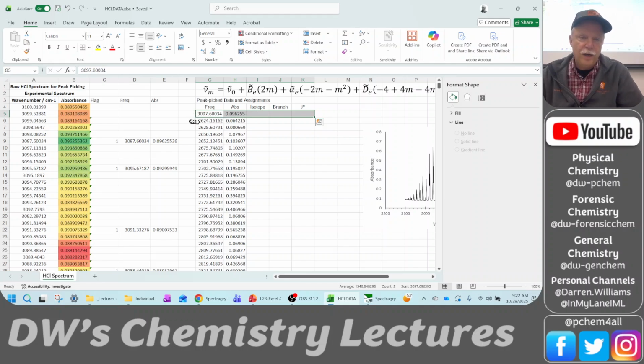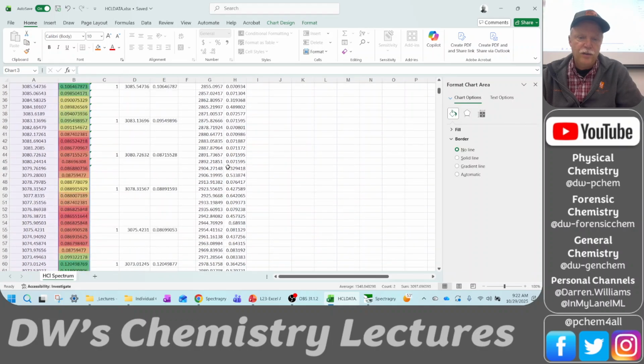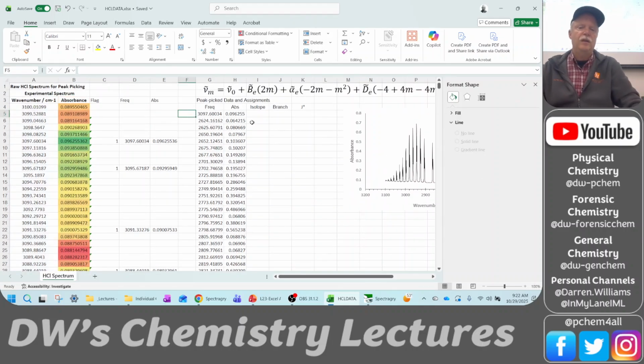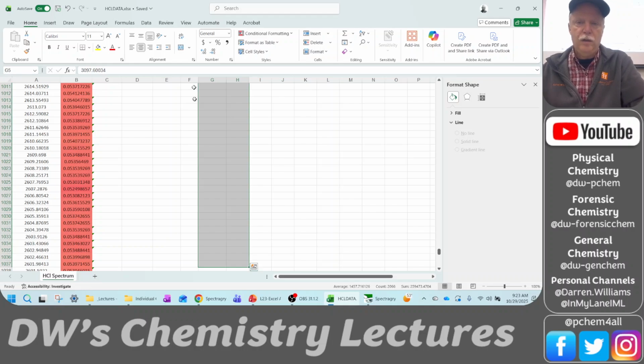Now, one thing I would like to do is to detect when we have some false values, some of those ones that don't have a good peak. So I'm going to say, let's take the difference. Let me resort.